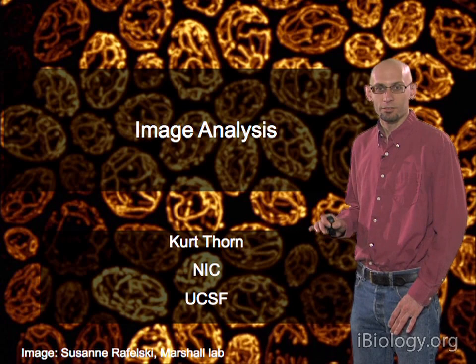And so the idea here is if you look again at this pixel intensity histogram, so here's the histogram. This time it's plotted on a log scale so we can see the dimmer information better. Again, like that first pixel intensity histogram I showed you, it's dominated by the background. There's this huge peak right here of the background data, all those pixels that are black and in the background. And then it very rapidly falls off. And then you see this long tail, which eventually goes away. And that corresponds to the white objects here, to the nuclei.